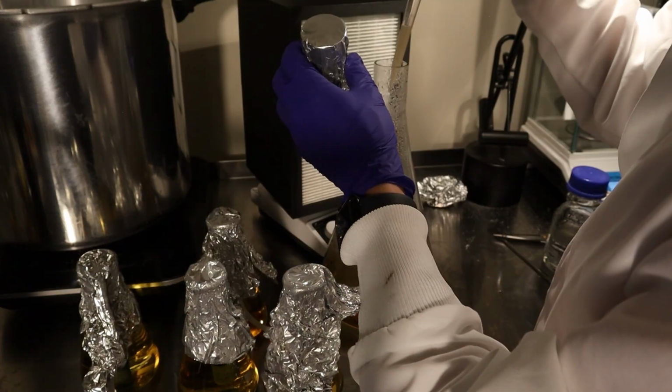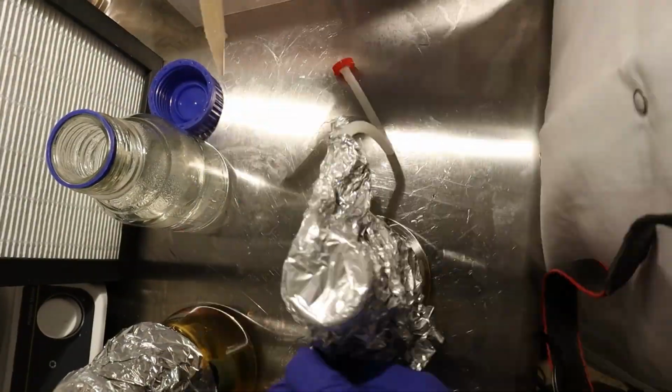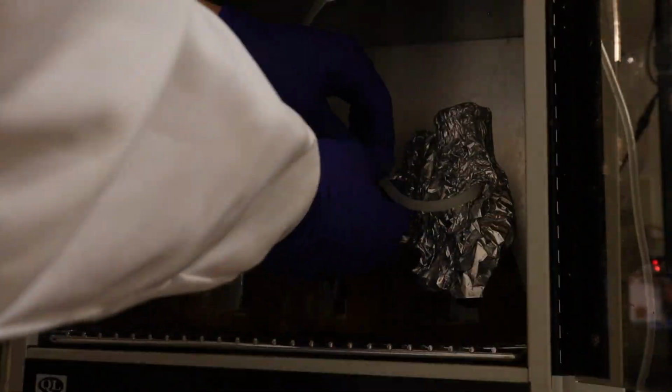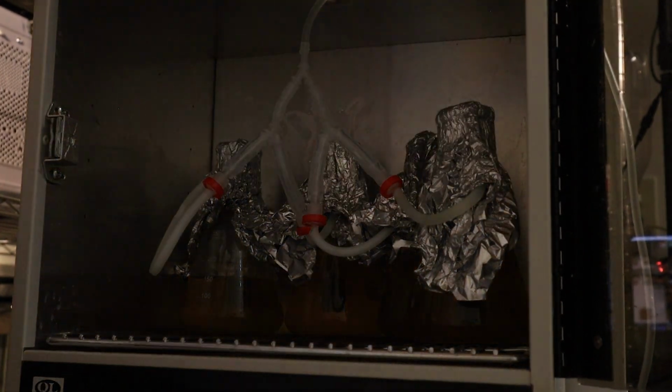After everything cooled, I inoculated the baffle flask first and then carefully added the autoclaved foam stopper and secured it to the orbital shaker. And then I inoculated the 4 250 ml flasks and hooked them into their incubator and turned on the air pump. Now for the moment of truth. Let's turn it on.